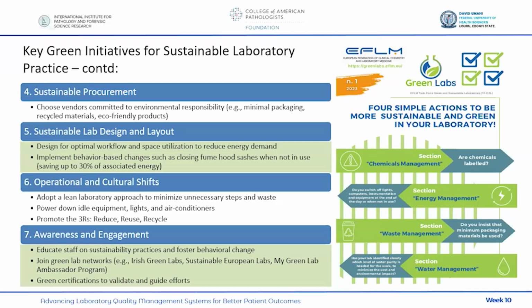Okay. Then you can join green lab networks. Some of them are Irish Green Labs, Sustainable European Labs, My Green Lab Ambassador Program. So join green lab networks. The advantage is that when you begin to move into the green initiatives, you will have challenges. When you meet challenges, you can talk with people who started before you. These are challenges we are having. How do we go around it? How do we solve this problem? And you rub minds with them. Of course, they carry you along. So that is the benefit of joining a network, that all of you work together and pull each other up along the way.